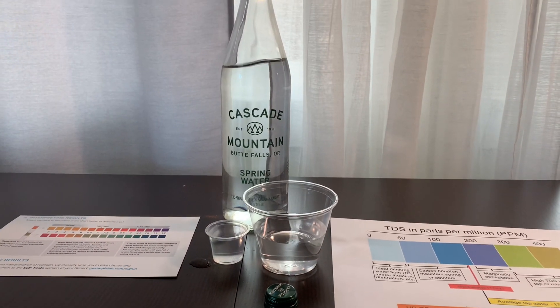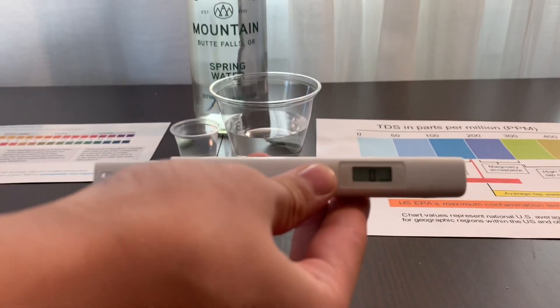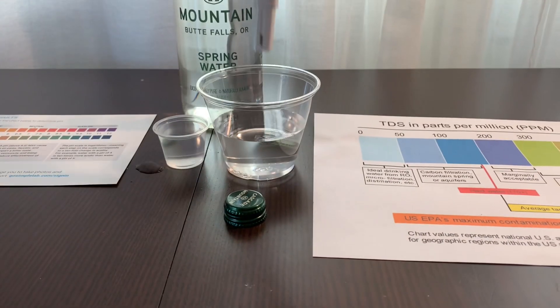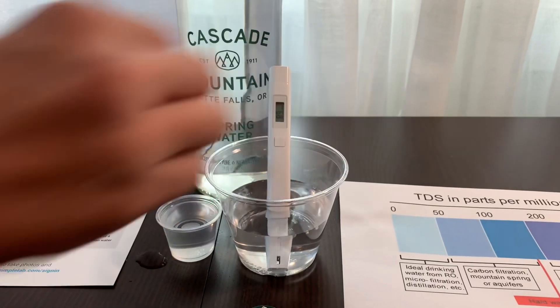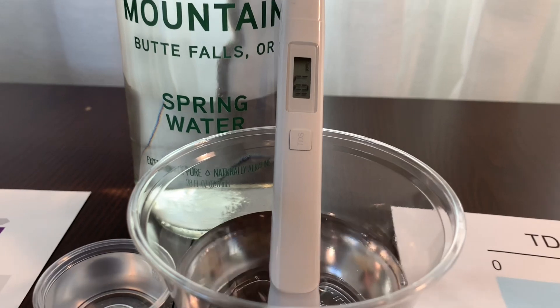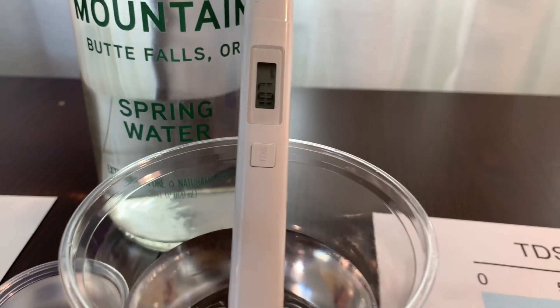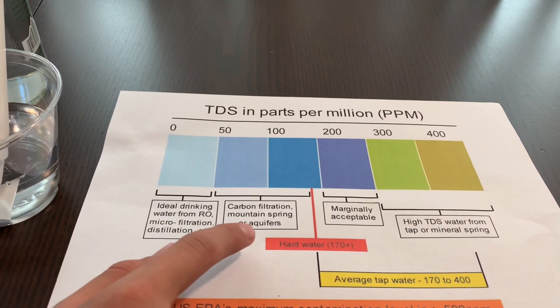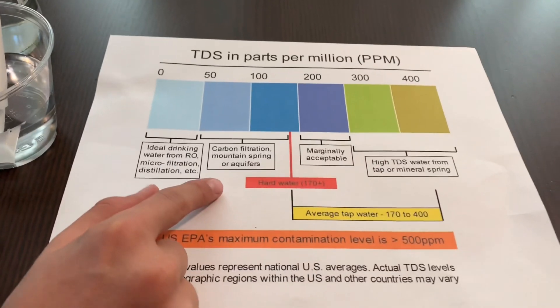First, let's test the TDS level. Turn on the TDS tester, make sure it says 0, and put it in. The reading is 106 — that is carbon filtered mountain spring water.